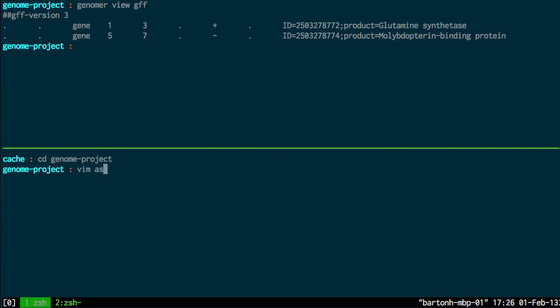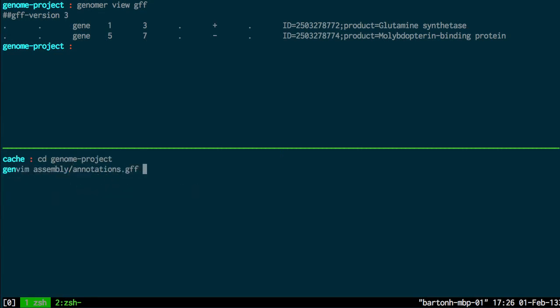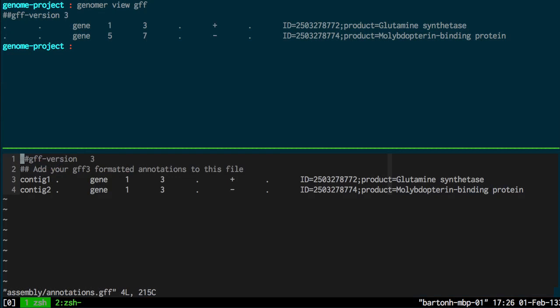But this time mapped onto the scaffold. So these are the annotations. So they all start in the first position of that contig. And here they're instead mapped onto their position in the genome.